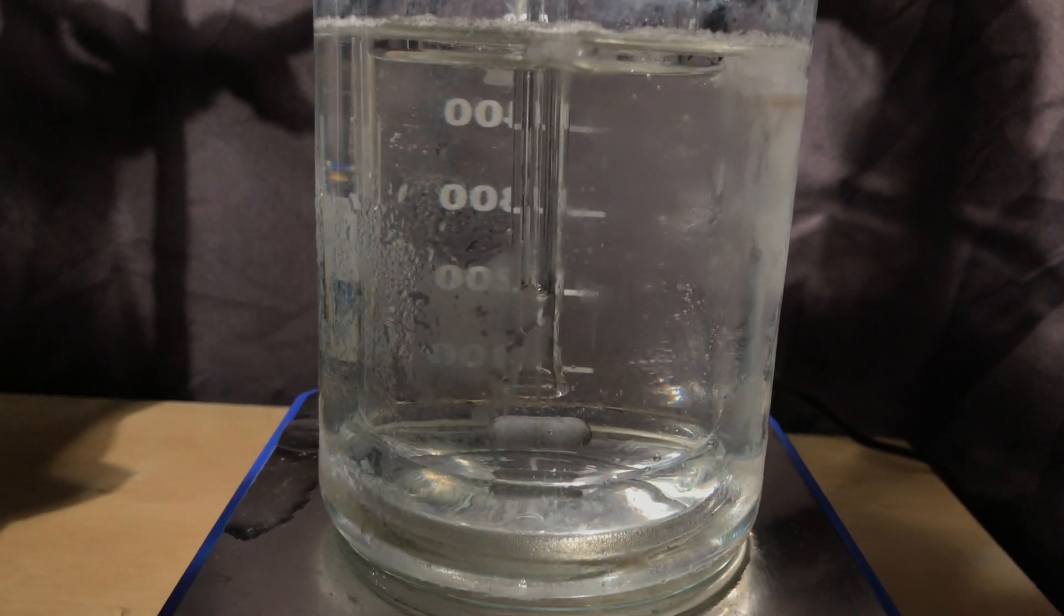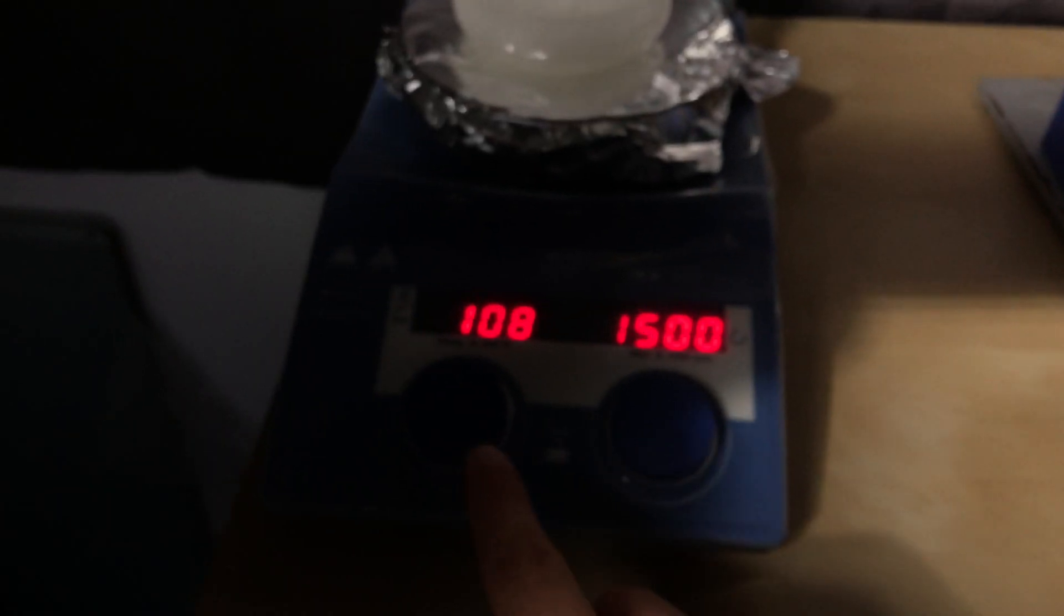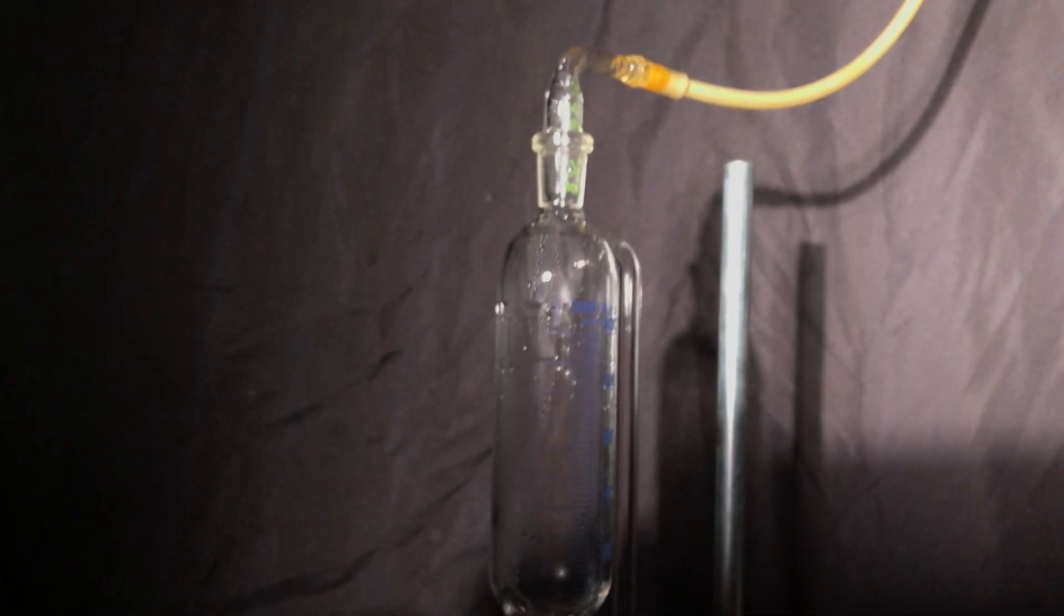You can see this right here. The liquid is slowly being sucked into the apparatus. Now we turned off the hot plate because we don't want any further dimethylamine to be produced and remove the hose.